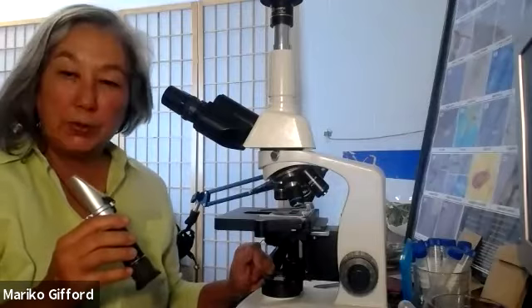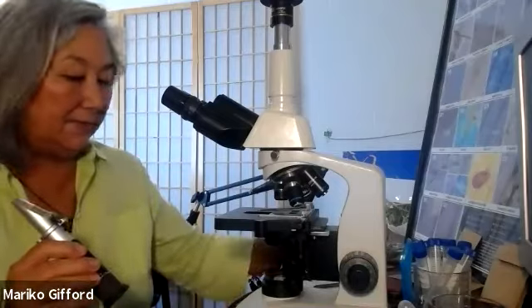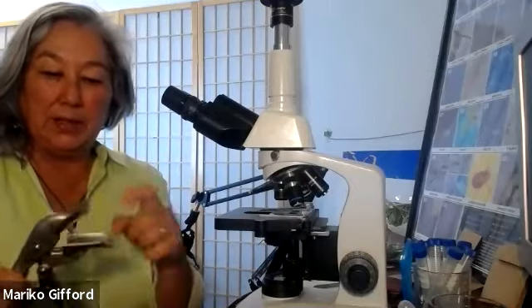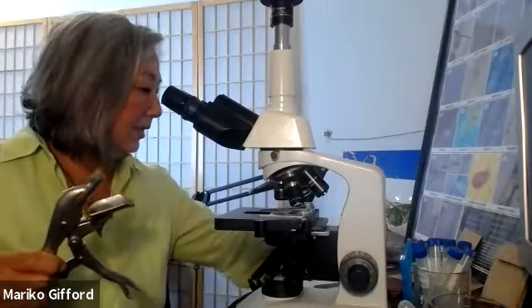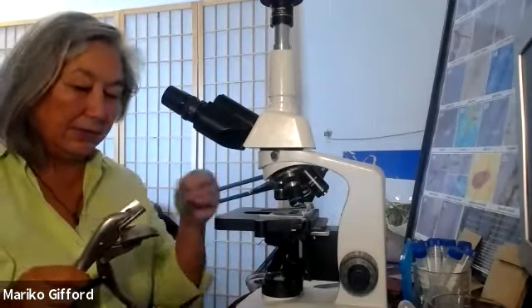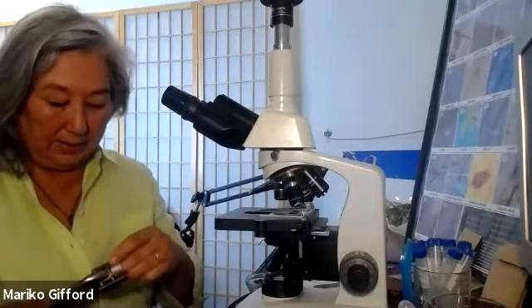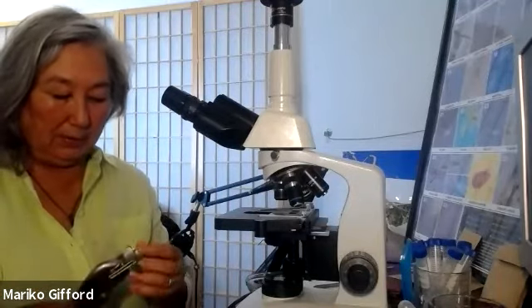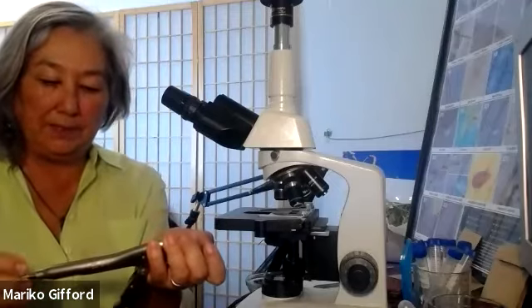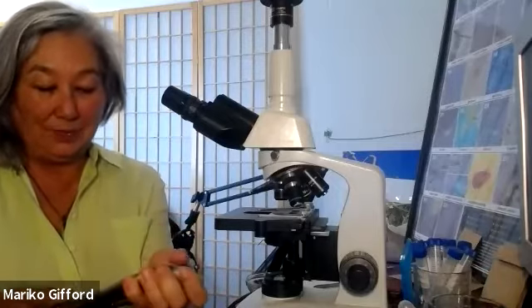and all you're doing now with this one, I get it from the Bionutrient Association, and they have created this very handy and useful tool, which is a vice grip that you can then put the moringa leaf inside this little slot here and clamp that down, because moringa has such a small amount of water that it's hard to get water out of that.